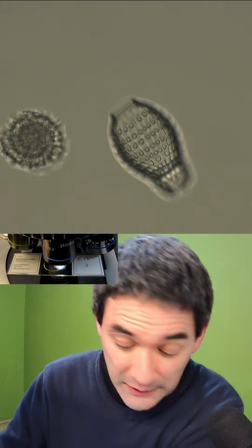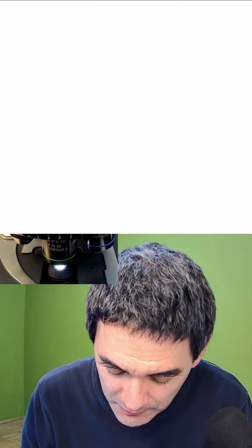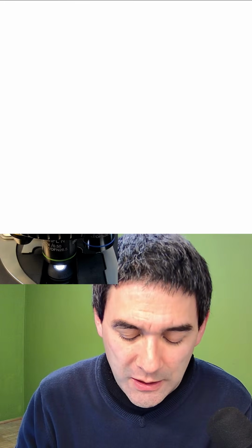So let's move on. I'm just on slide number 3, but I've still got so many left that I want to show you, and some of you also want to see a couple of animal tissues. This one here, that's actually okay. That's actually an interesting one.